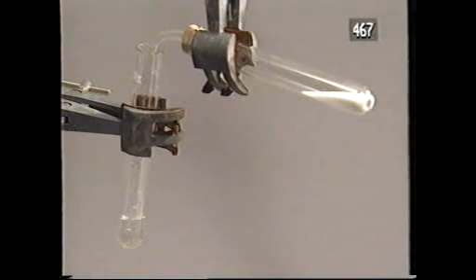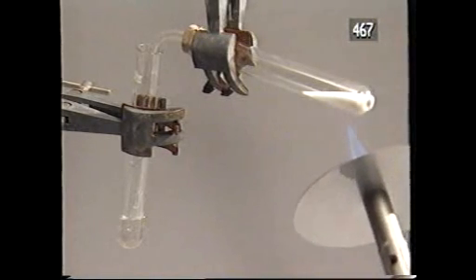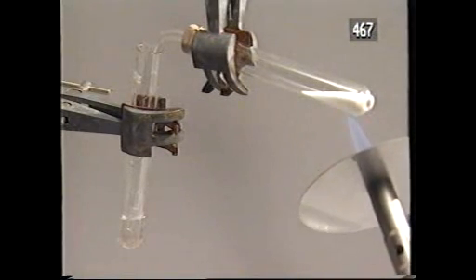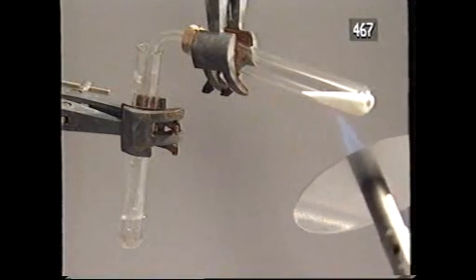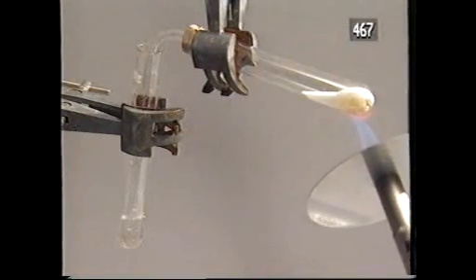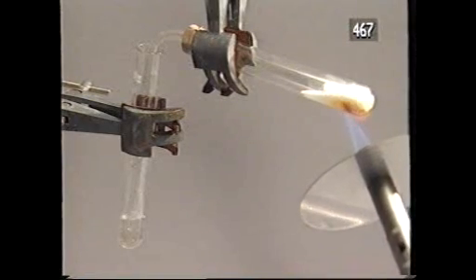I've put the sugar into a cork test tube. The cork carries an exit tube that dips into water. So, when I heat the sugar, the heating will occur in a confined space and the sugar won't burn. Instead, it decomposes to charcoal.